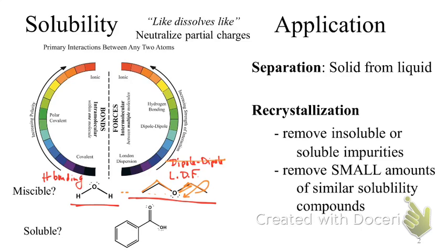Because it can be difficult to refer to each layer by its name, we'll sometimes switch that up, particularly if we switch between using a different organic solvent. So typically we'll call it our organic layer and an aqueous layer. If we were going to try to then dissolve benzoic acid, the compound now down below, where would that compound likely be most soluble? In the aqueous layer or our organic layer?